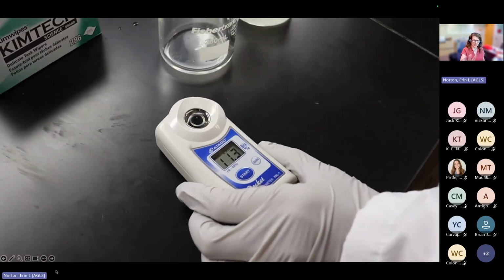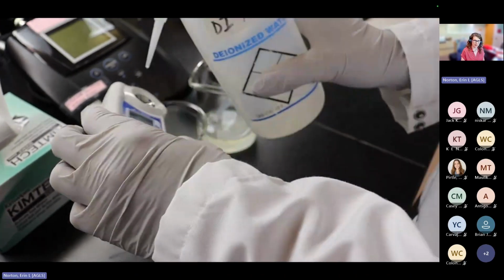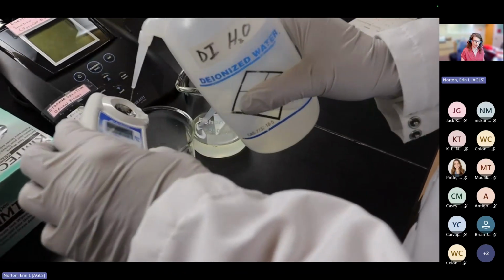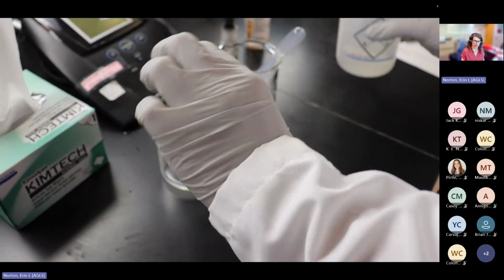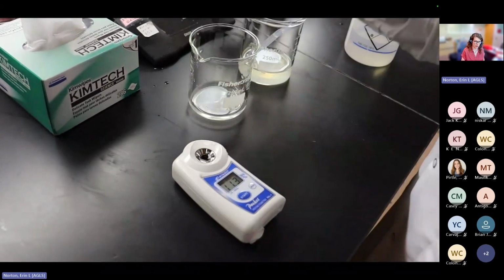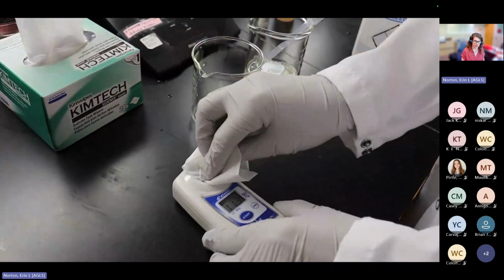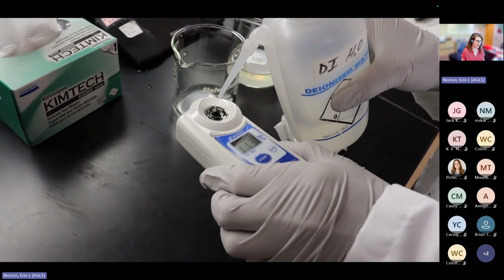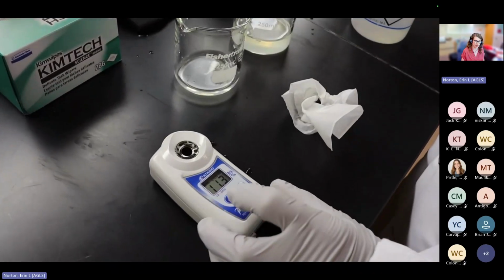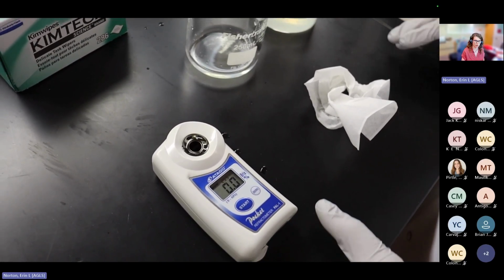Okay, so we had some juice on there. We took our reading. We're cleaning the refractometer with deionized water between each sample, rinsing it with water into a waste beaker, using our lint-free tissue to dry that out. Between each sample, you need to clean with deionized water. Really, really important. Otherwise, the residual sugar that's left over, the residual solution will affect.